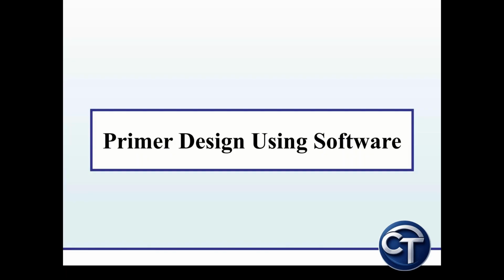Now let's dive into the primer design using different software. First of all, let me tell you the complete workflow step by step. Firstly, you have to retrieve the target DNA sequence from any database. Then you will select the region of interest. And thirdly, you have to input the sequence into primer design software. That software will generate candidate primers and other parameters for you.